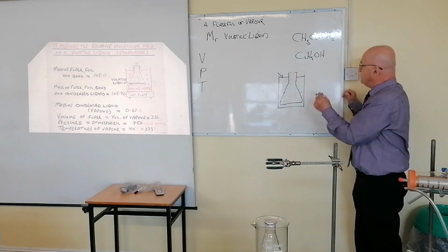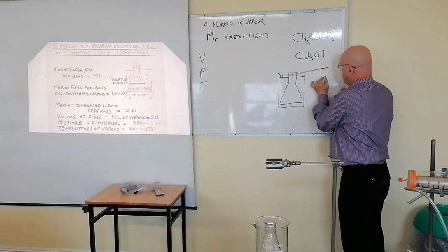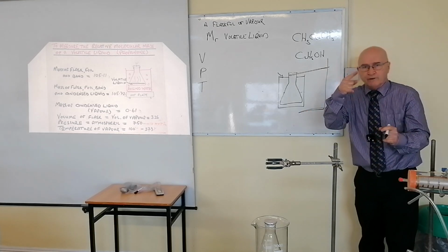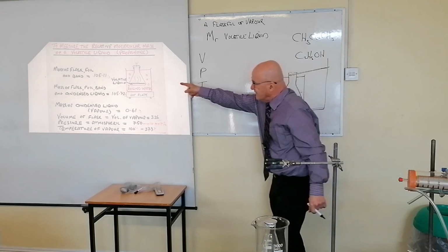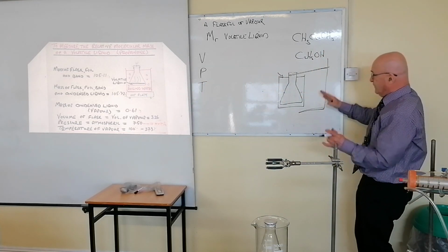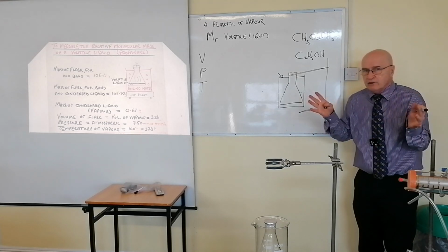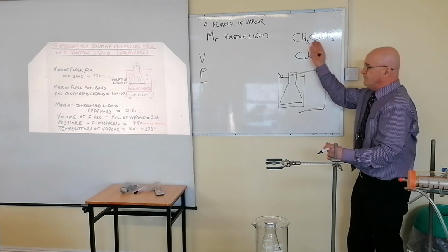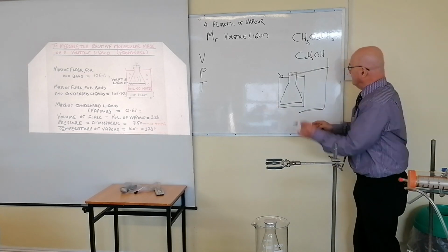The next thing I'd say to you is, I would be putting a clamp on that. Nothing fancy now, but something like that, and tell me it's a clamp. They know you have the cop on to realise that that won't sit there in the water. It needs to be restrained, and therefore just mention that, like I have done there now, as a clamp. Nothing fancy here at all, no fancy diagrams, but make it fairly big. That should be at least a third of an A4 page now. Okay, that's the second detail, okay?